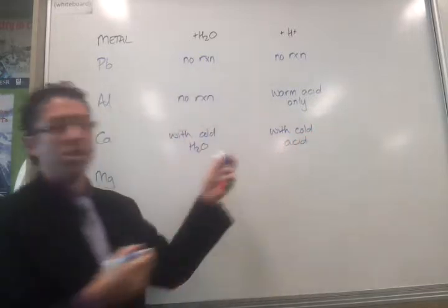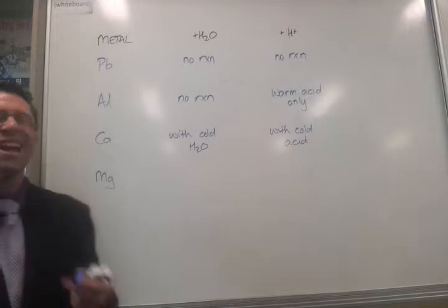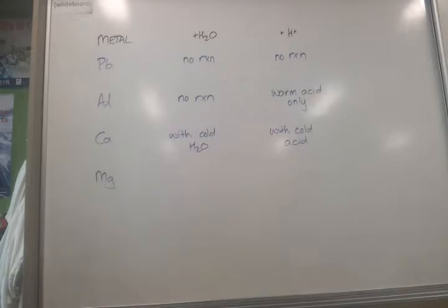Right, and the reason I'm not putting which acid it is there is because some groups use nitric, some use sulfuric, some use hydrochloric. Didn't matter, as long as you're consistent with which acid you used. Magnesium with cold water? No. No, we're getting lots of no's there. Did anyone get to react even just a little bit with hot water? Yeah, a couple of groups did.